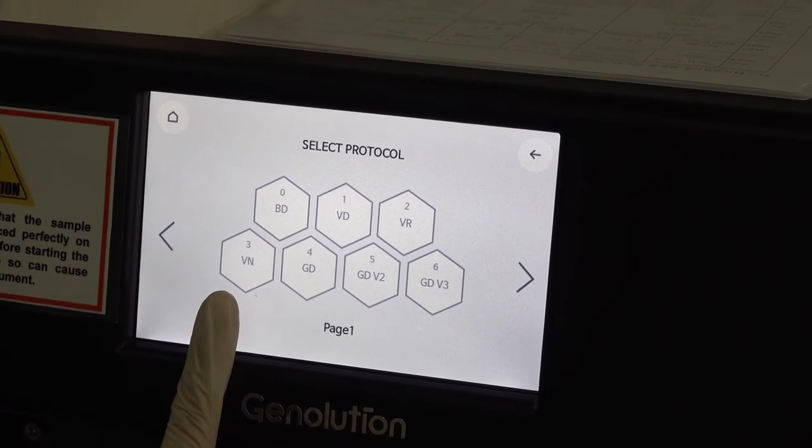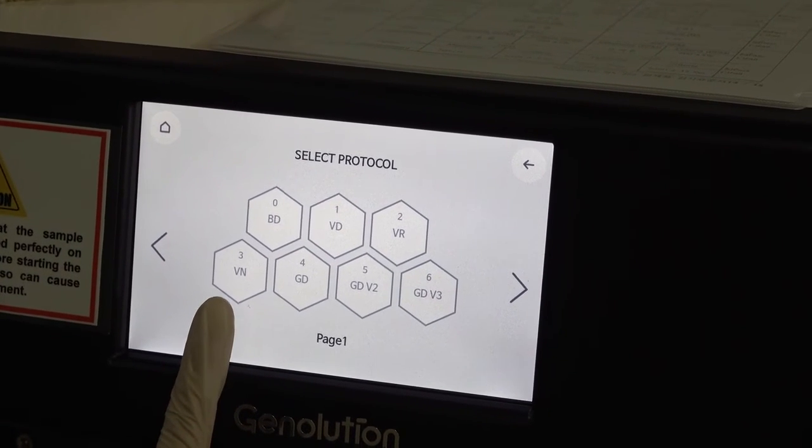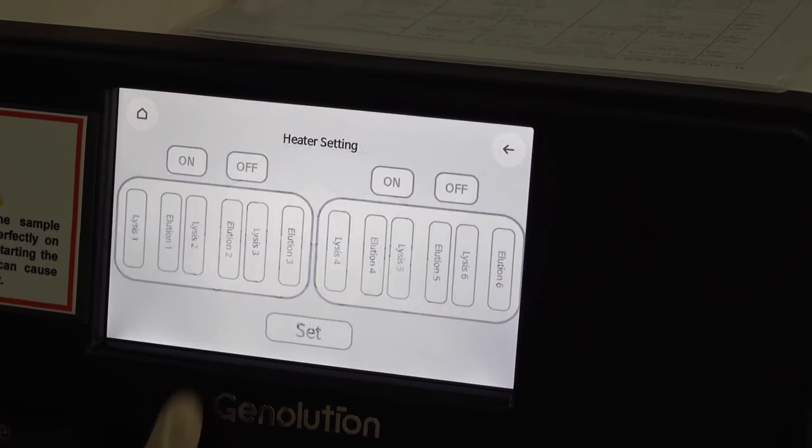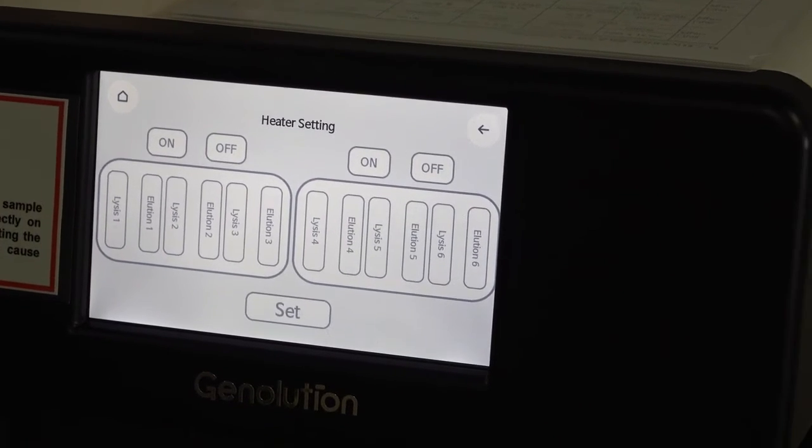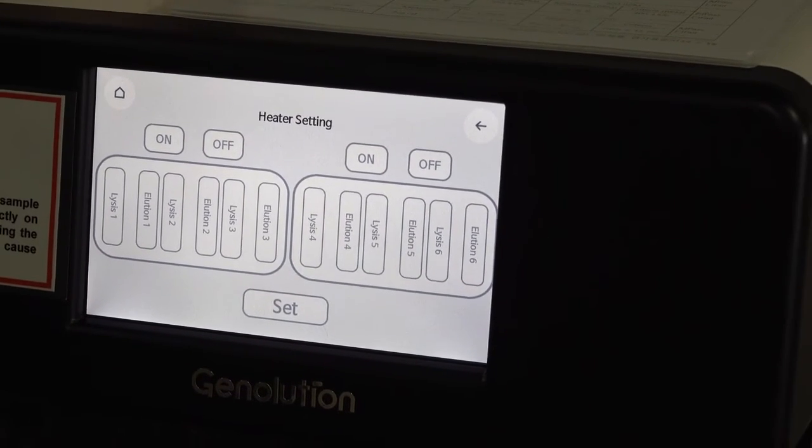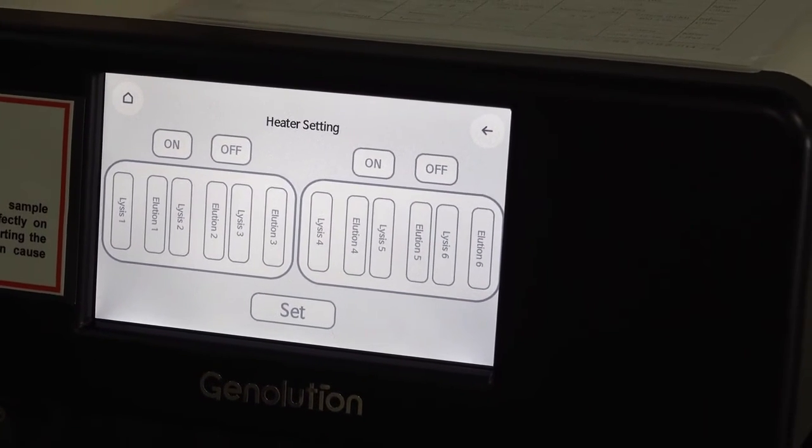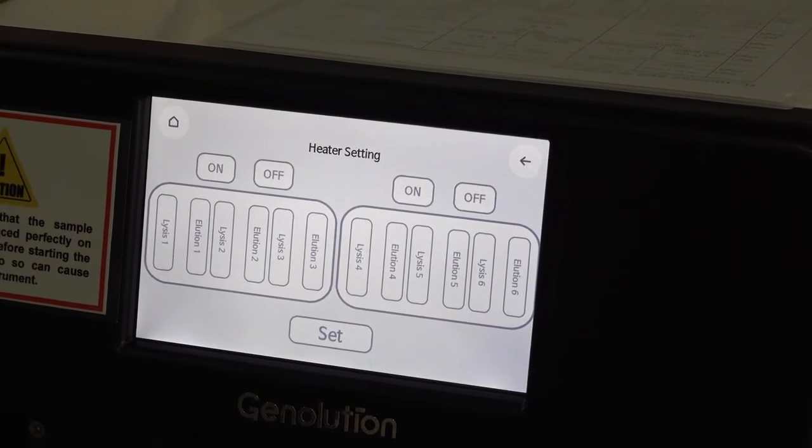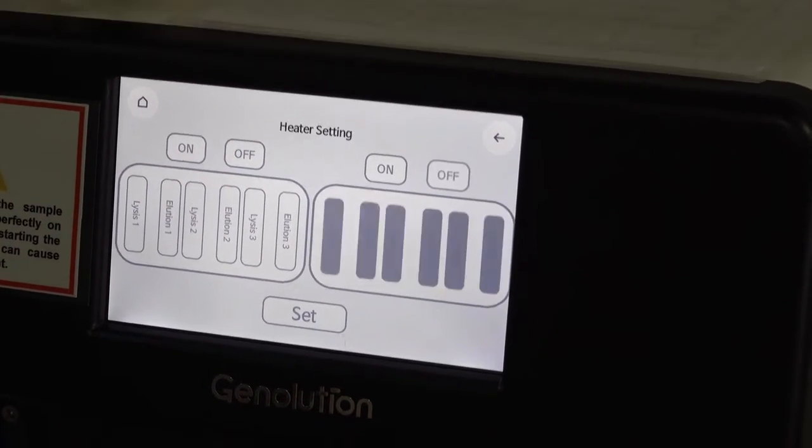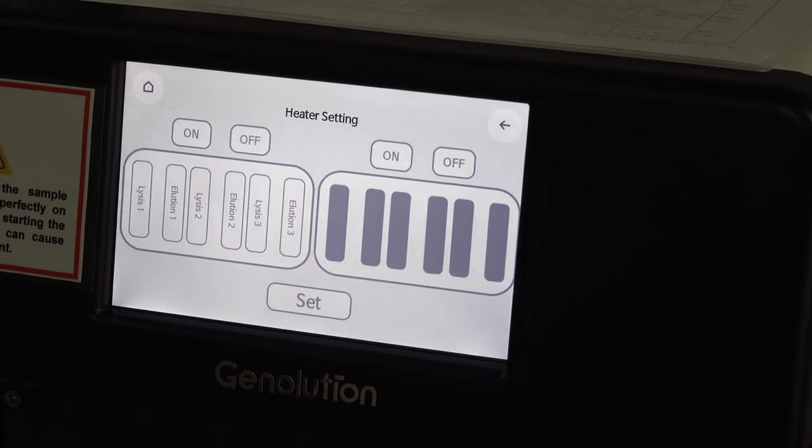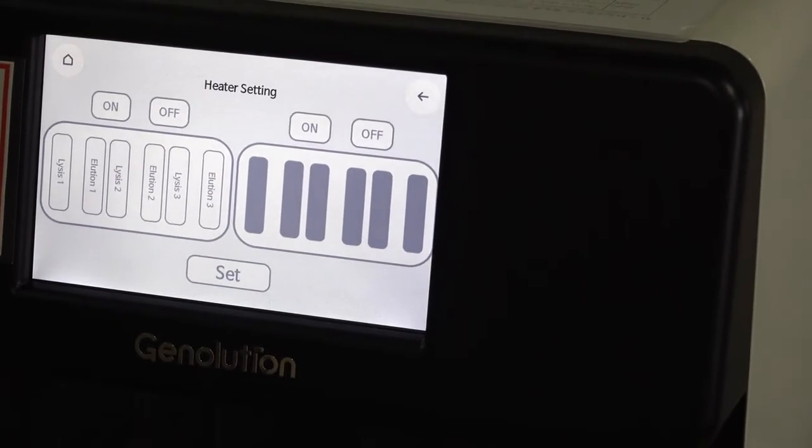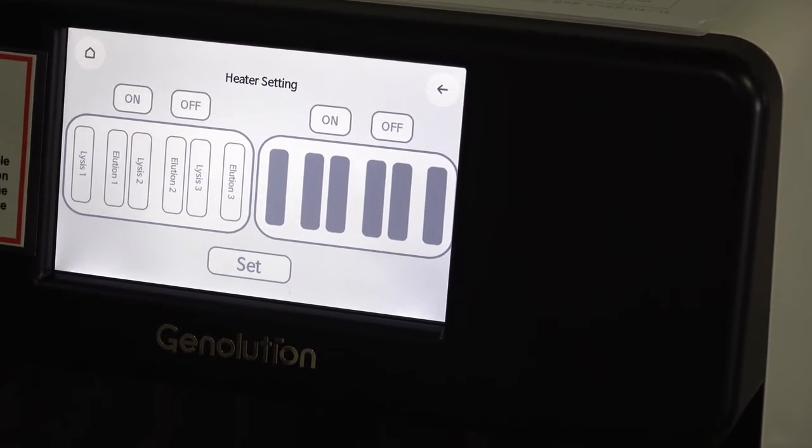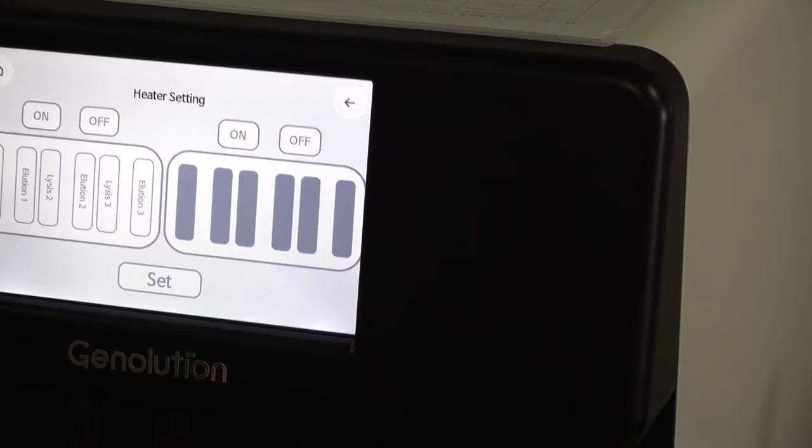In this case, we are going to select for viral nucleic acid. So that is 3. Select 3. The machine will ask you whether you need to heat up the blocks. If you have installed two blocks, please set both to ON. If you select only one block, you may select only one block as ON and the other one as OFF. When it is a grey symbol, it means that the block is OFF. Now the instrument has been set and is ready for operation.